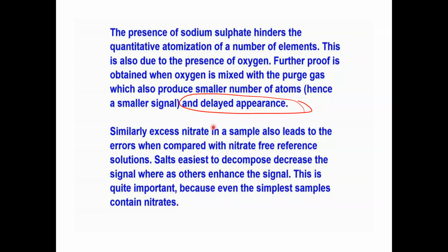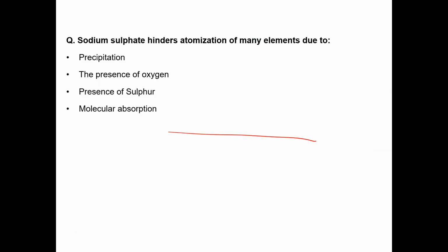This is due to the presence of oxygen, right? Why? Because some oxides are very stable, or molecular absorption can also be a reason for this, right?